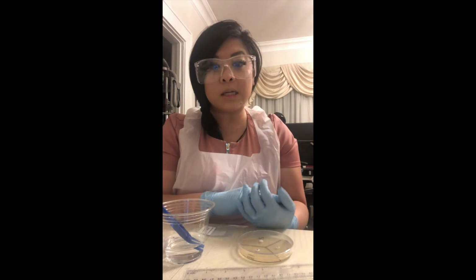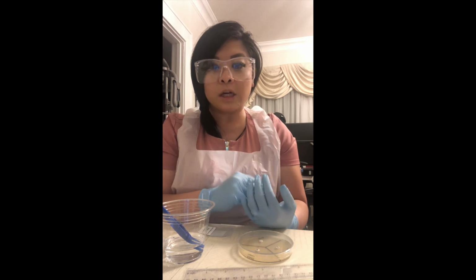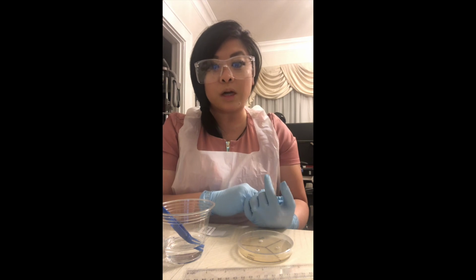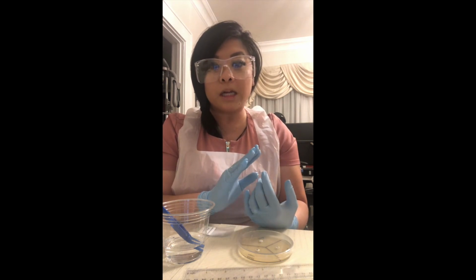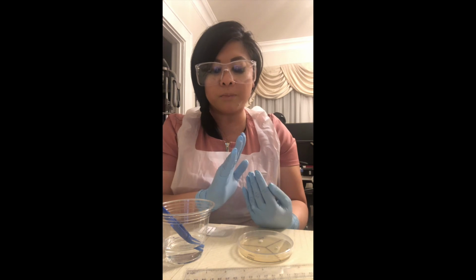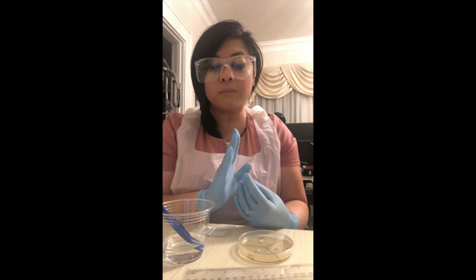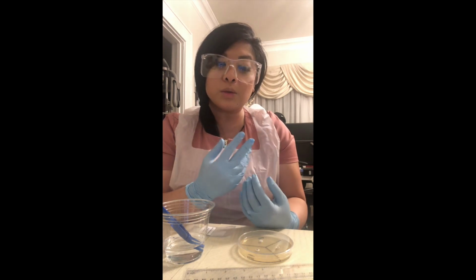My hypothesis for this experiment is that the Staphylococcus epidermidis, being a gram-positive bacteria, will exhibit resistance to novobiocin and gentamicin and will be inhibited by penicillin because it is a narrow spectrum antibiotic that targets gram-positive bacteria, and the bacteria cells will lead to its death.